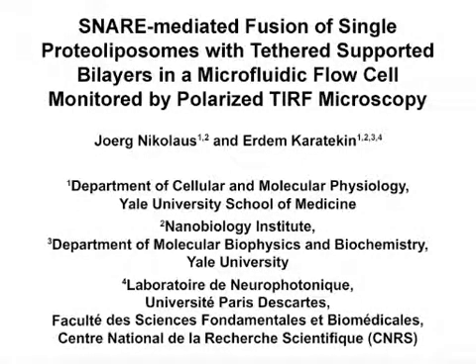The overall goal of this assay is to observe individual membrane fusion events driven by neuronal and exocytotic SNARE proteins to understand fundamental mechanisms of neurotransmitter and hormone release. This method can help answer key questions in the membrane fusion field, such as how cargo release occurs through a dynamic fusion pore and the fate of the pore after fusion.